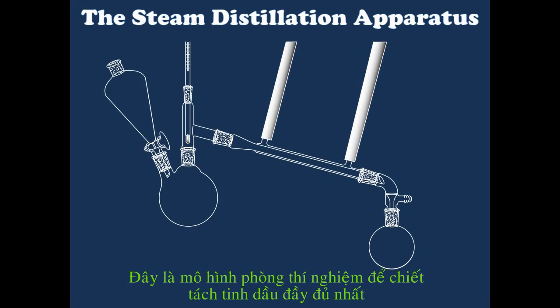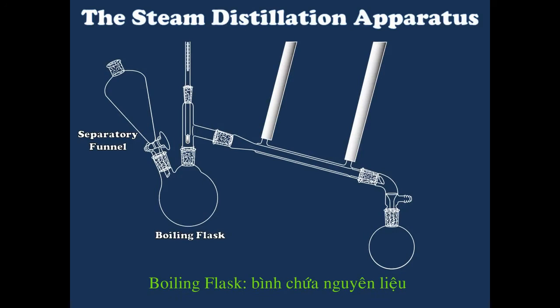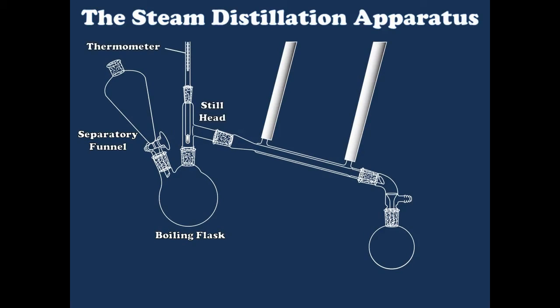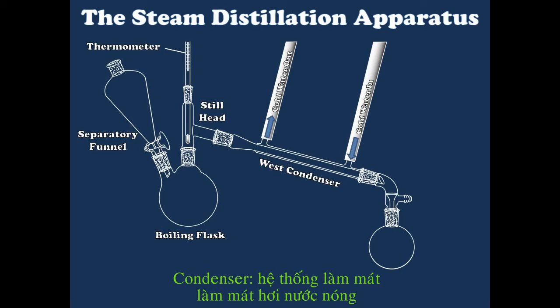Of the steam distillation apparatus that you'll most likely use in a teaching laboratory. The apparatus can be supplied with additional water when needed. The boiling flask will contain the oil, low volatility material, non-volatile material, and also the water will be boiled. Vapor leaves the device through a still head. Don't be surprised to hear that the temperature in a steam distillation is usually about 100 degrees. From the still head onward, the system is going to look exactly like any other simple still. Water enters the condenser through the lower of the two hose barbs and out through the higher of the two hose barbs.